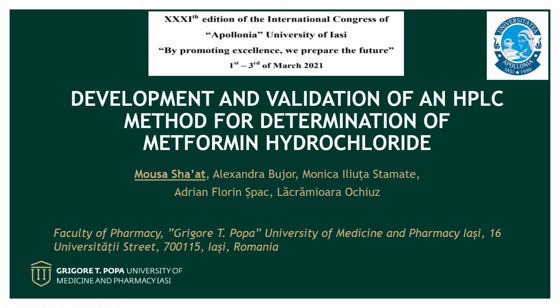Hello. I would like to bring to your attention some aspects of the paper entitled Development and Validation of an HPLC Method for the Determination of Metformin Hydrochloride.